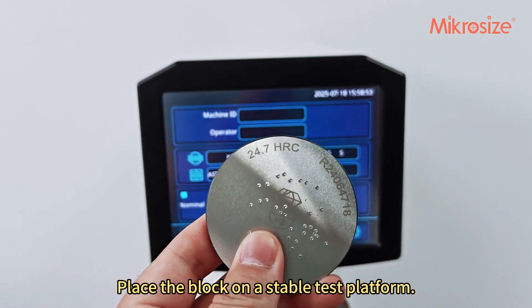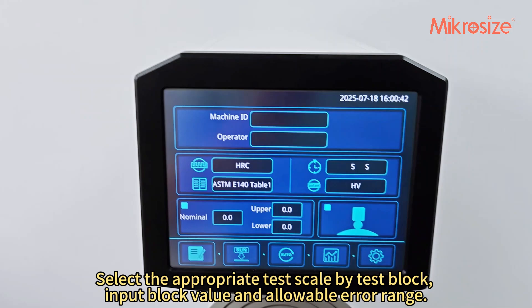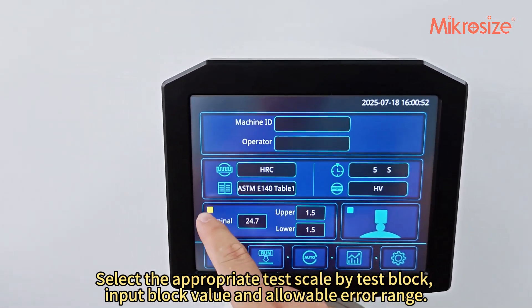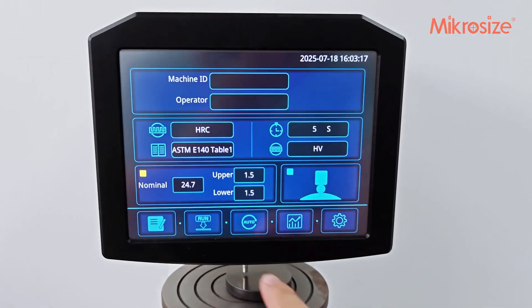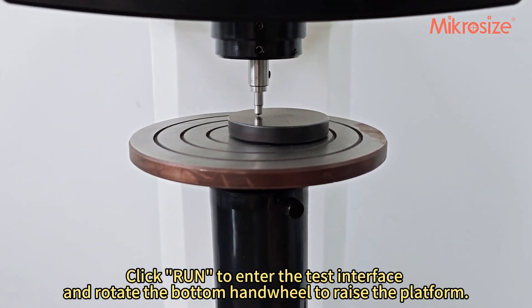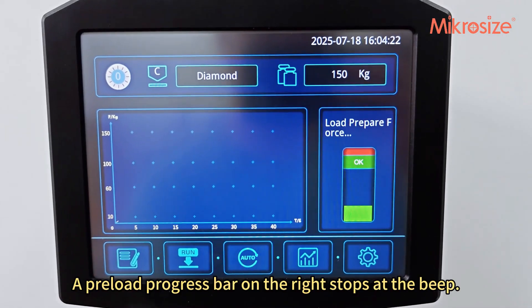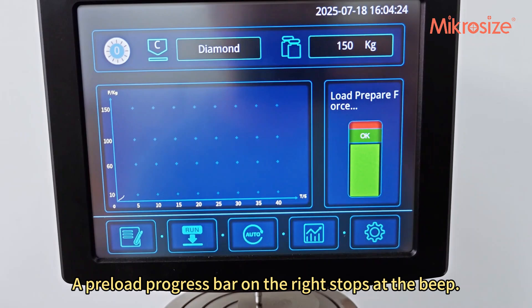Place the block on a stable test platform. Select the appropriate test scale by test block, input the block value and allowable error range. Click Run to enter the test interface and rotate the bottom hand wheel to raise the platform. A preload progress bar on the right stops at the beep.